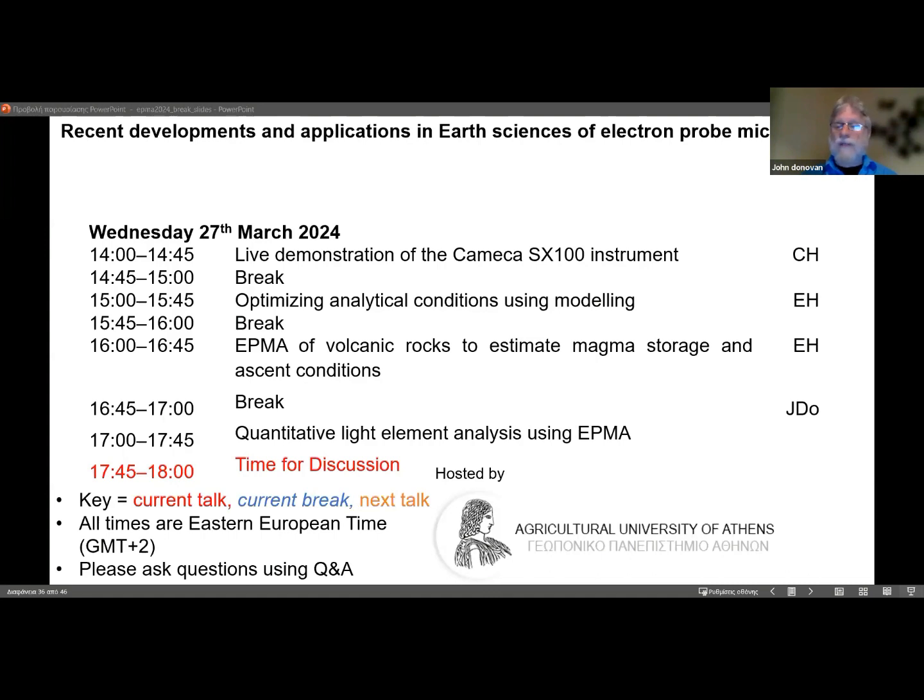Now, other situations, like if you're analyzing for trace oxygen in vanadium, good luck. It's a bear. So it depends on the physics of the situation. But you can get improved detection limits by using multiple spectrometers. That's all I'm saying. I have a question before we move to another one from one of our attendees.